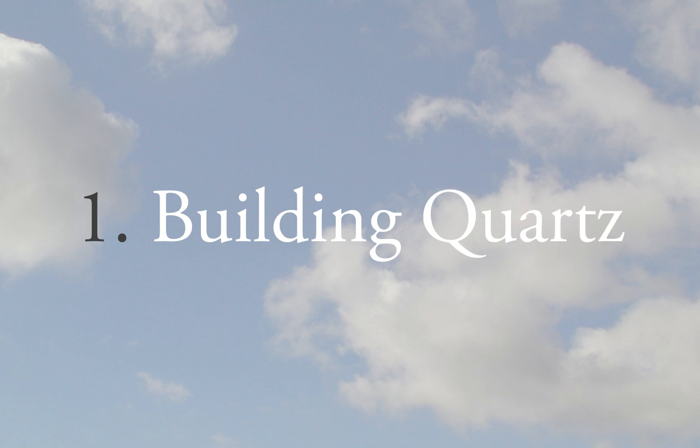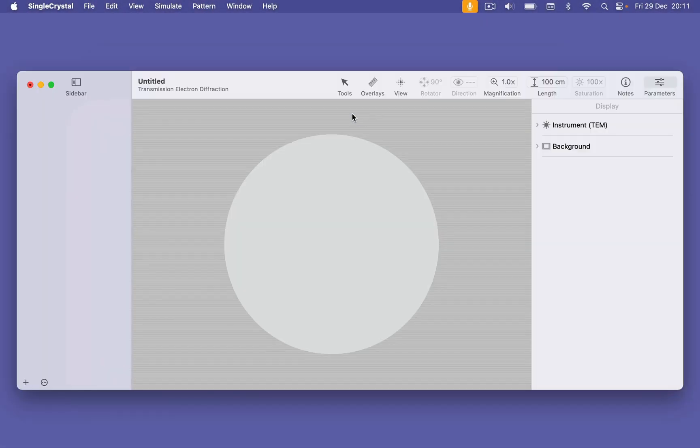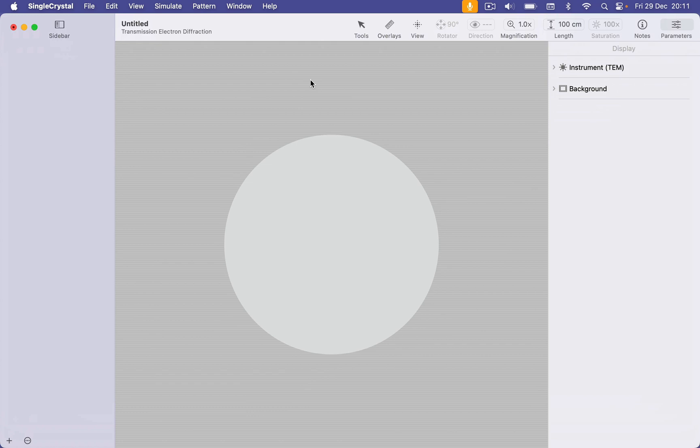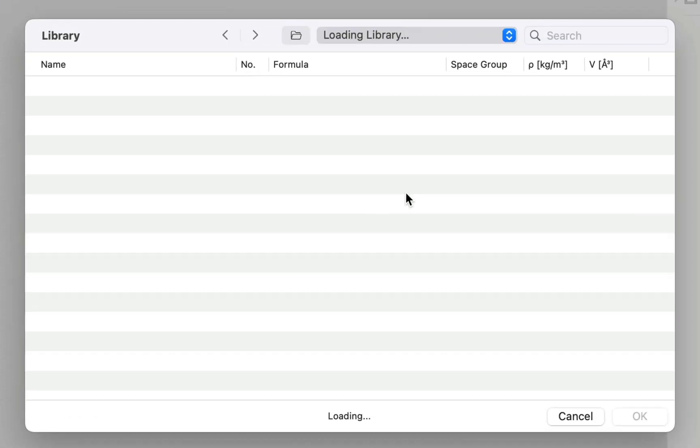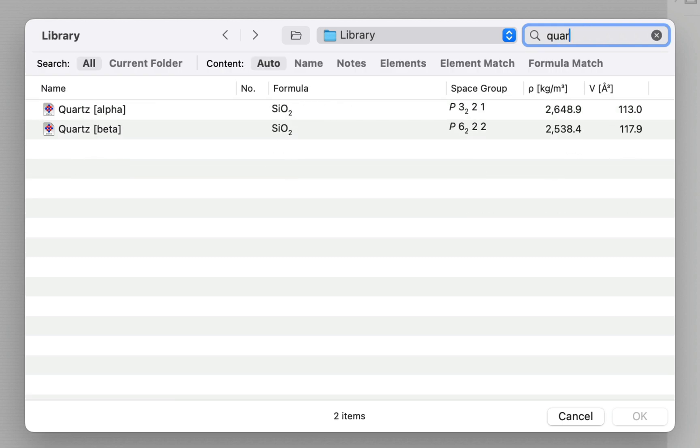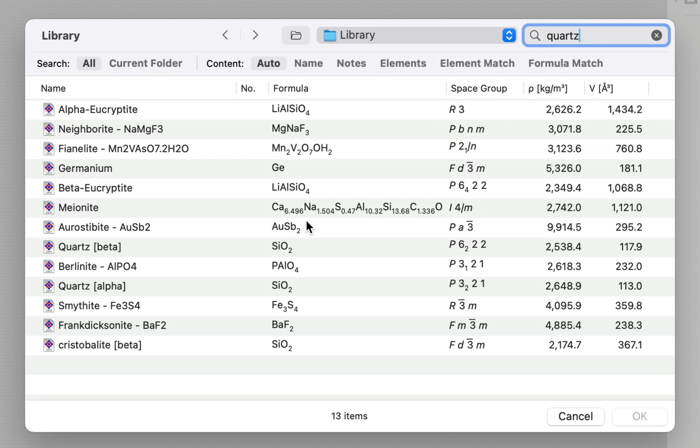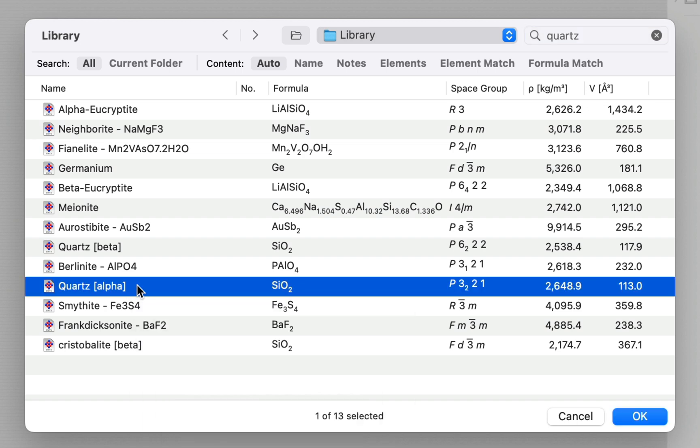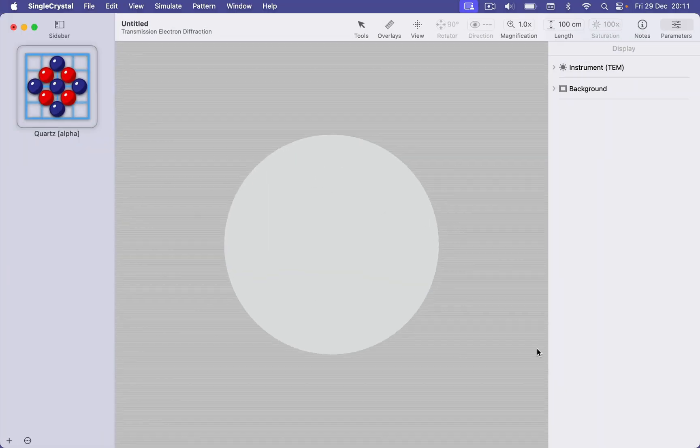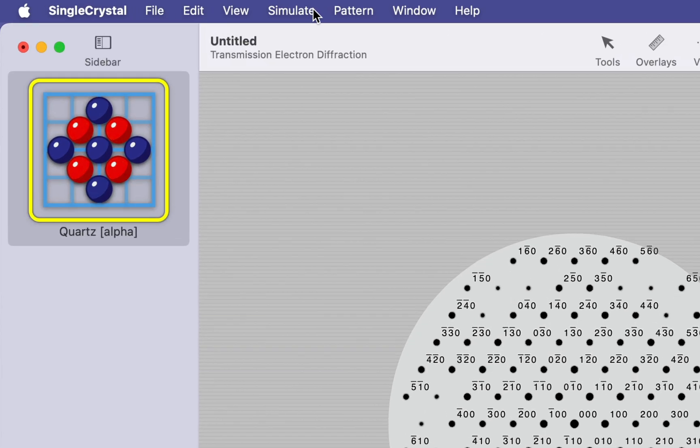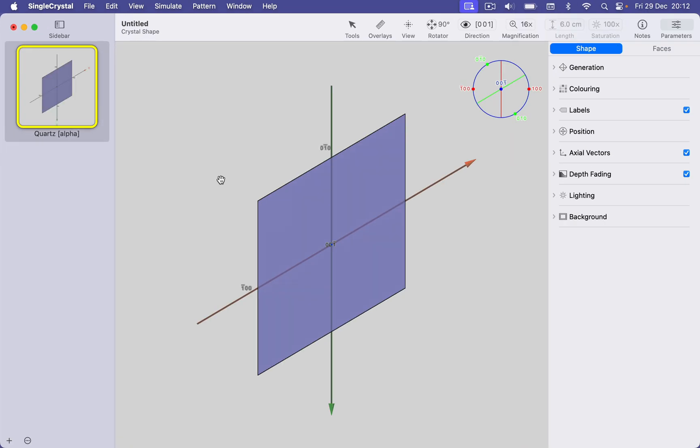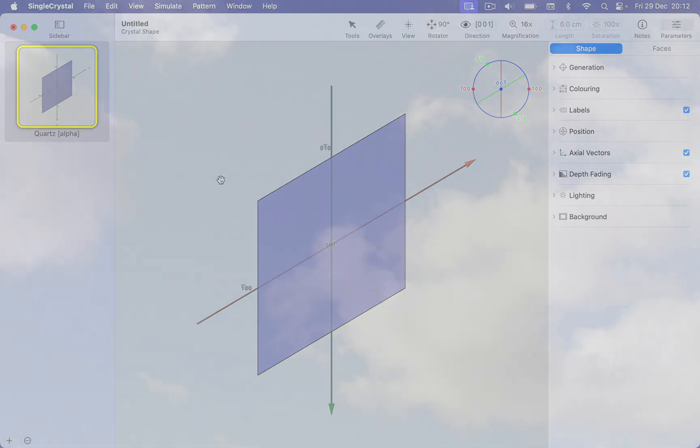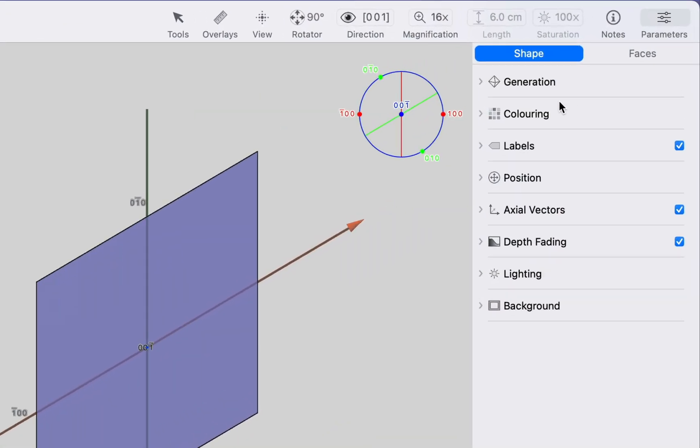We'll start off with a new document, and we're going to add the quartz structure from our built-in structures library. Let's search for quartz in the library, and I'm going to choose the alpha quartz structure. We're now going to create a 3D crystal shape by changing the simulation mode.